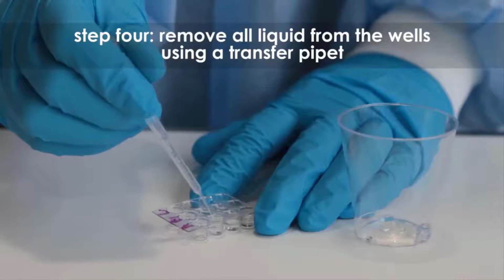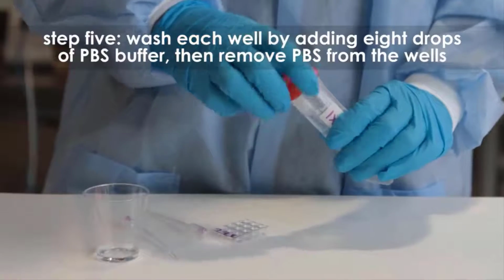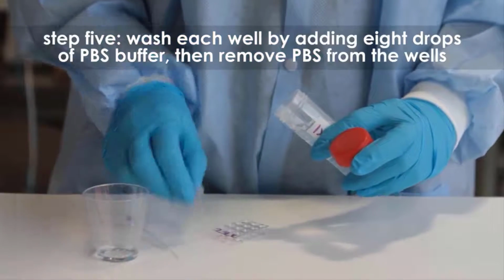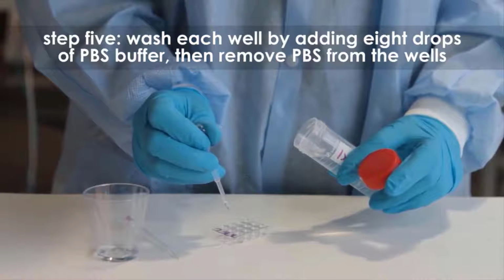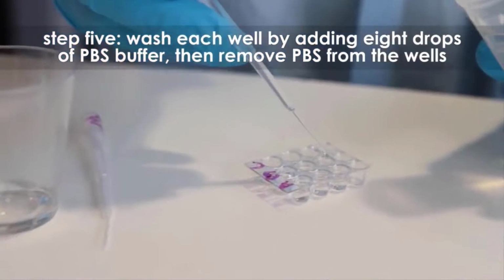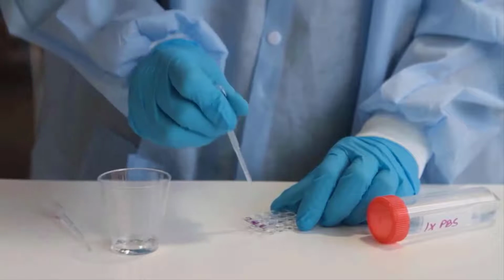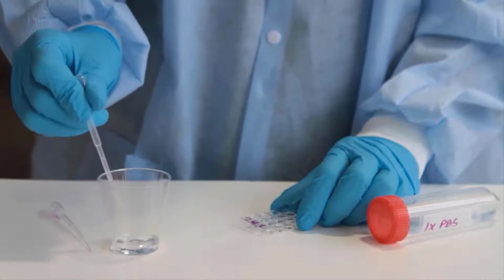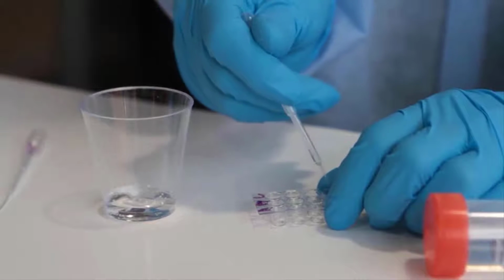Step 4. Remove all the liquid from the wells using a transfer pipette. Step 5. Wash the wells by adding approximately 8 drops of PBS buffer to each well. Remove all the PBS from each of the wells, taking care to prevent the buffer from spilling over into adjacent wells. Traditionally following this step, the wells are blocked with a protein-containing buffer to prevent non-specific interactions between the antibody and the plastic wells. We have optimized this experiment to eliminate this step.